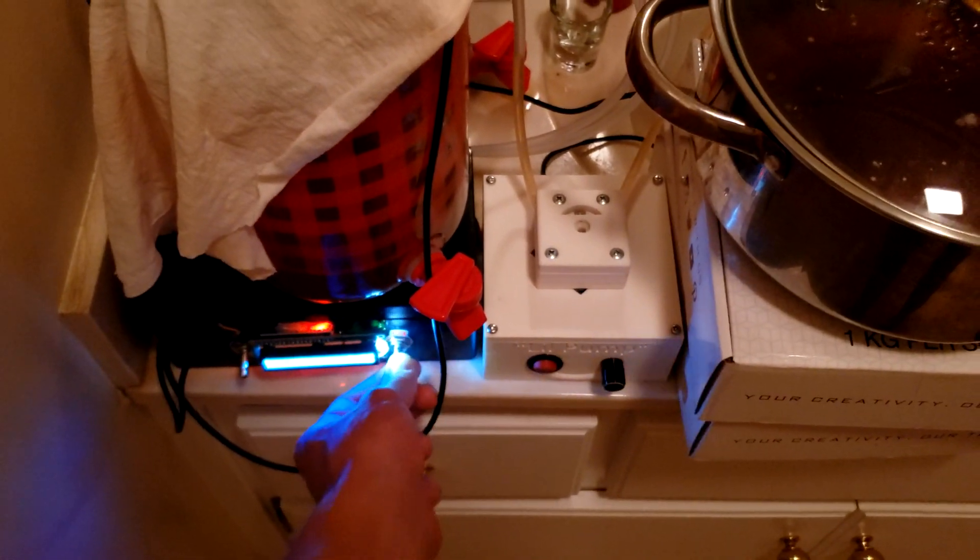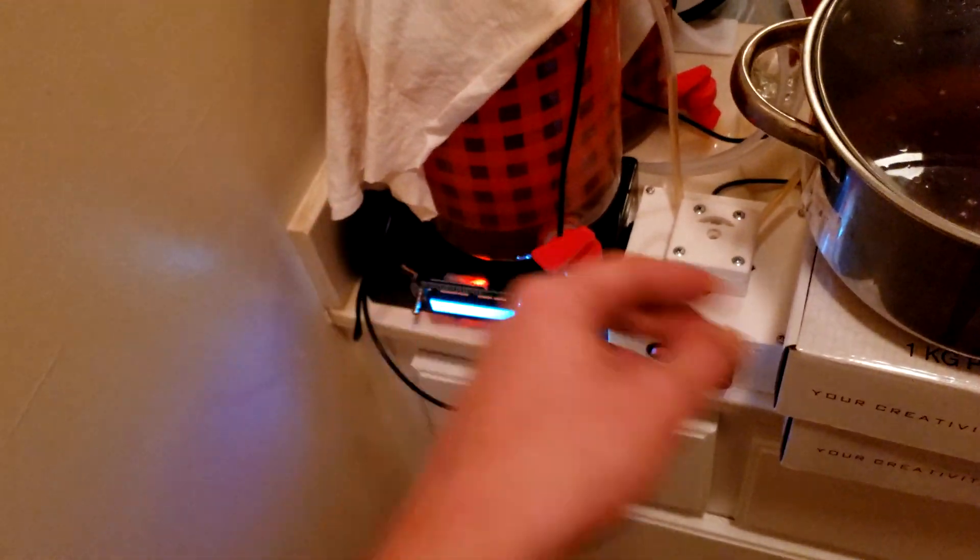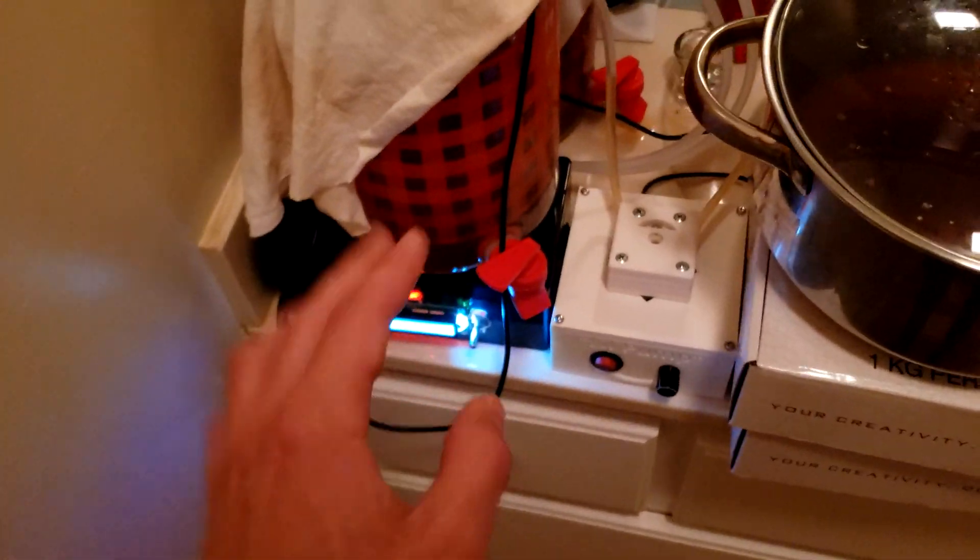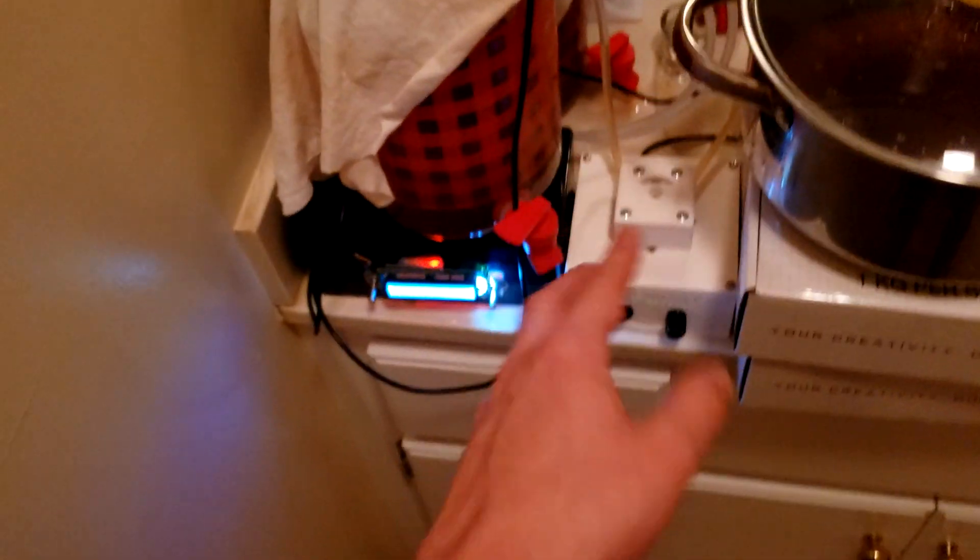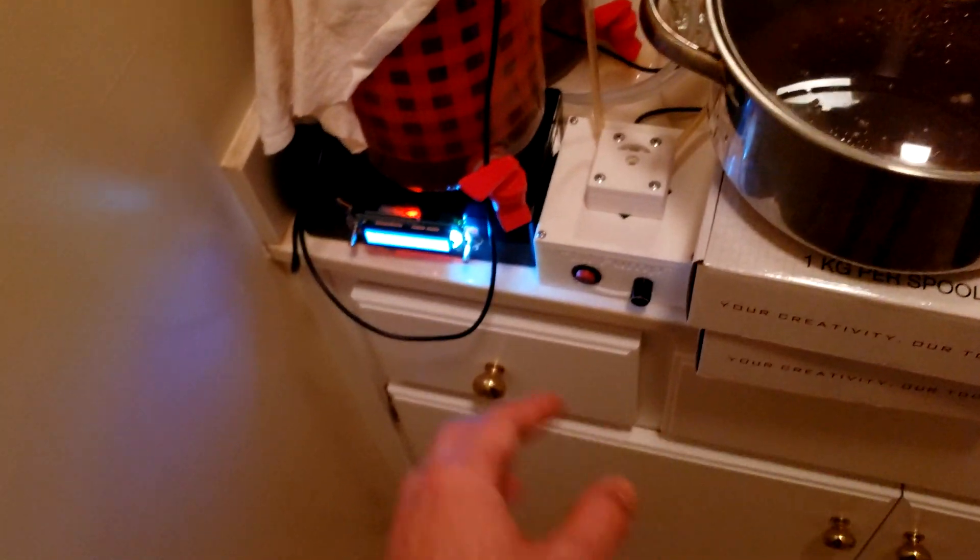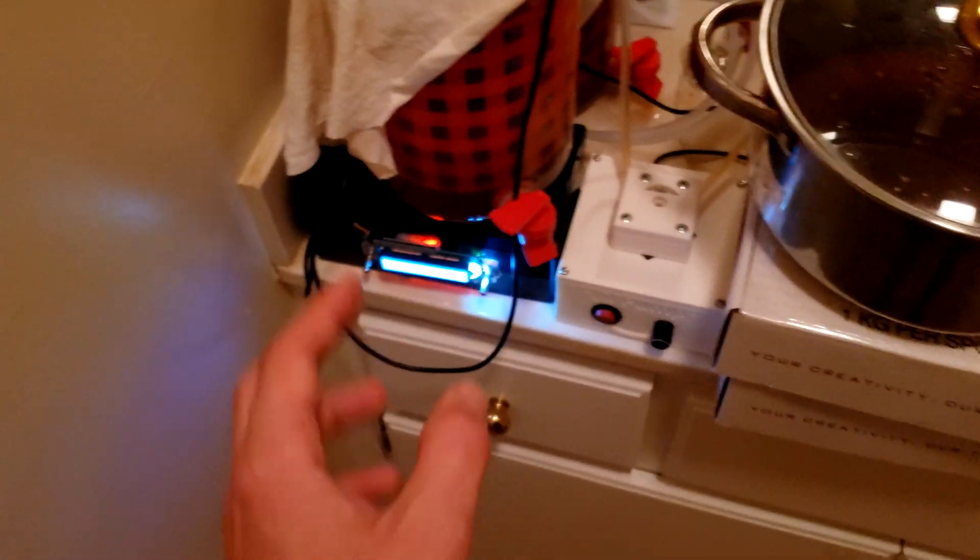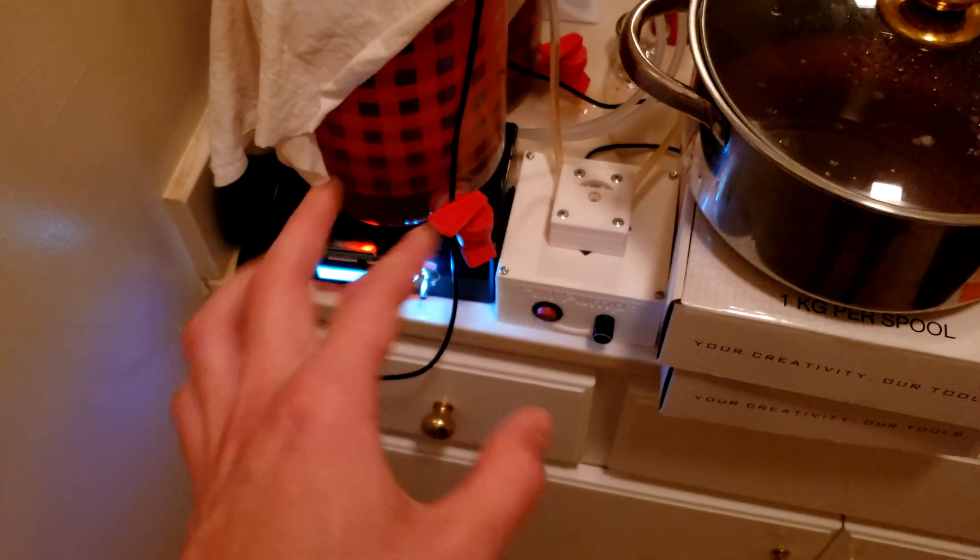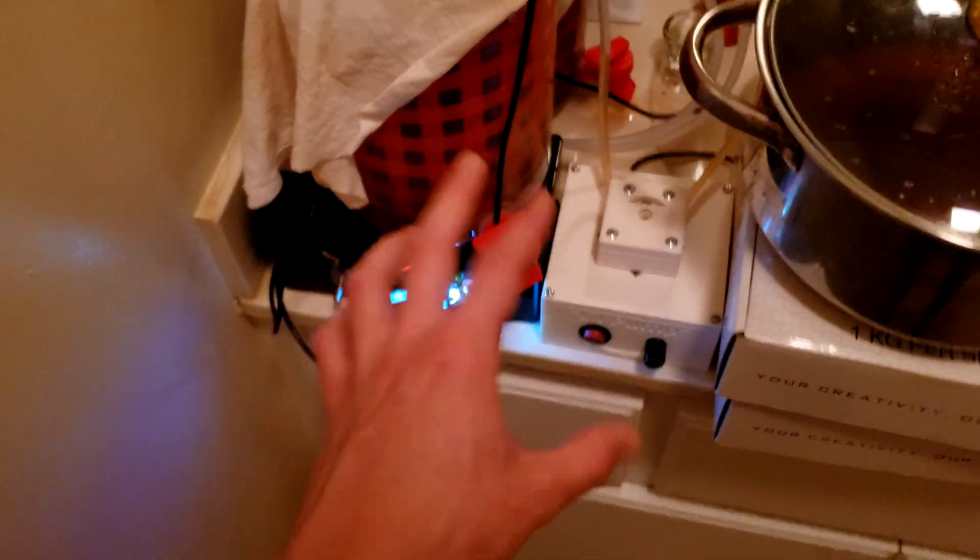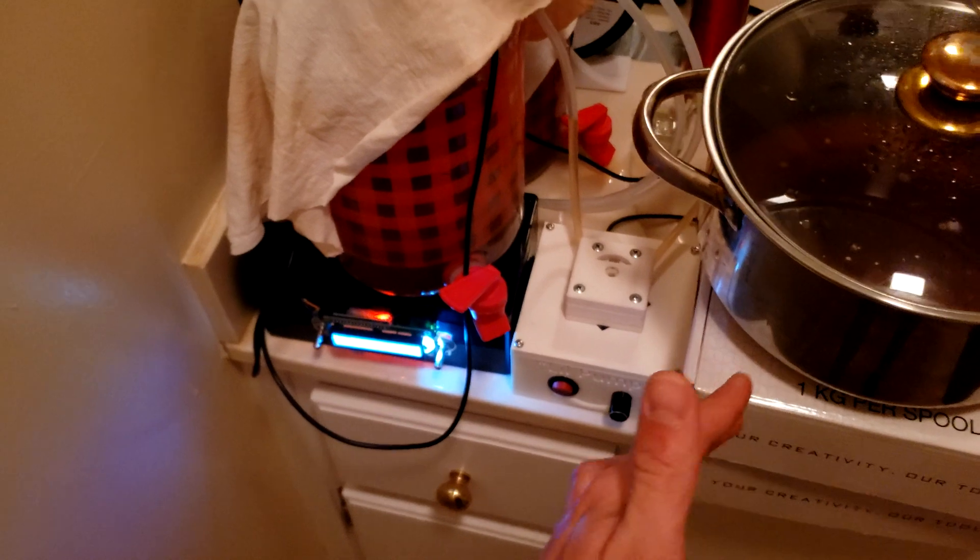So there's the argument of garbage in equals garbage out. I'm using garbage tools, so I'm getting garbage results. And I think that's kind of true and it's true in a lot of cases. But I think I learned a lot here and there's a lot of features that I know now that I need in the next iteration. So again, the next iteration, everything should be incorporated into one piece. I think that's really important. I need better holders for the hoses and things like that, better media sterilization, better control of the two different experiments. No experiment is going to be perfect.